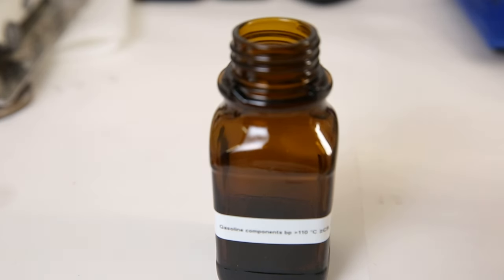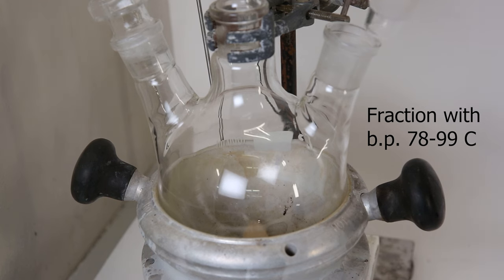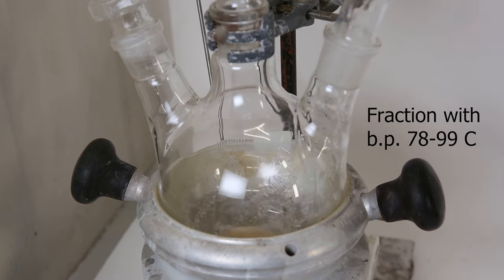Now I will redistill the fraction between 78°C and 99°C, to separate the heptane and iso-octane in the mixture from the other compounds, and get a clearer view what is in there. I put the fraction back into the flask, and started heating it again.